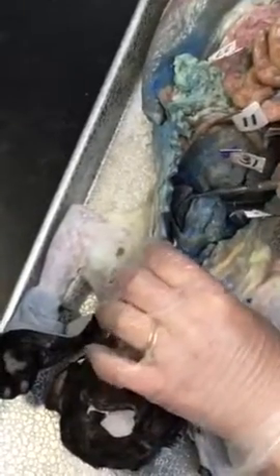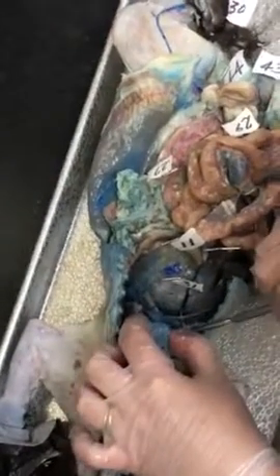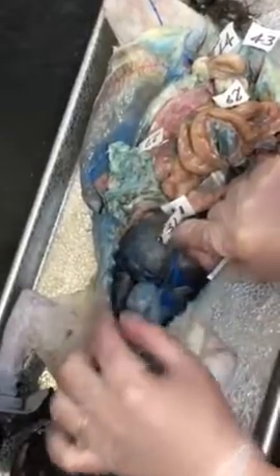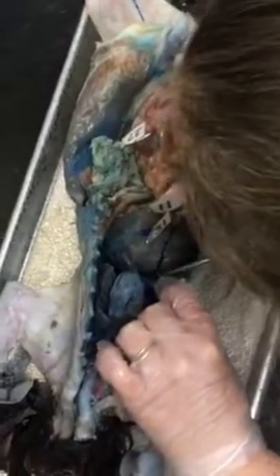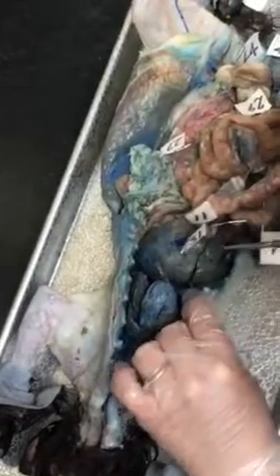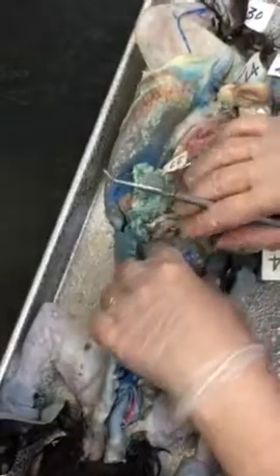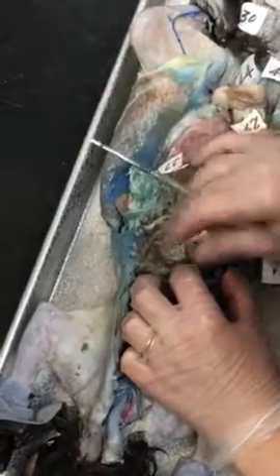Okay, heart and lungs are pretty easy. This is the diaphragm. It's a muscle sheet that separates the thoracic cavity from the abdominal cavity. Helps you breathe. You lift it up, and there's the falciform ligament, which we did on the other video. Our liver, and we did all the parts of the liver on the other video. Then we've got our stomach.